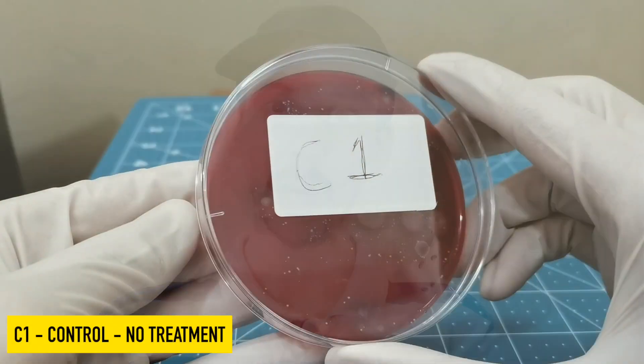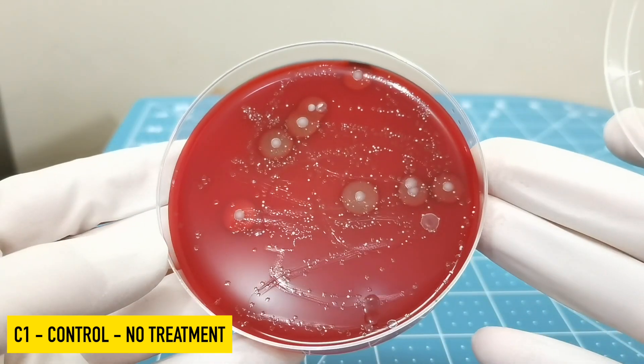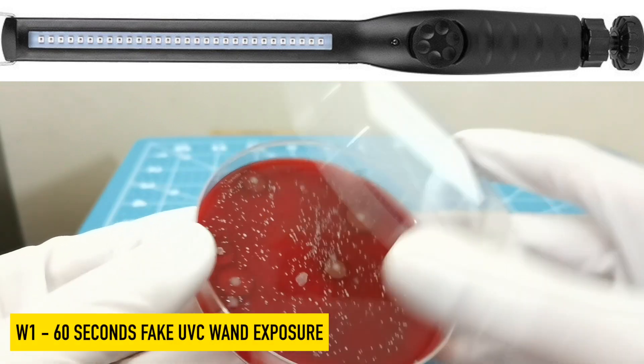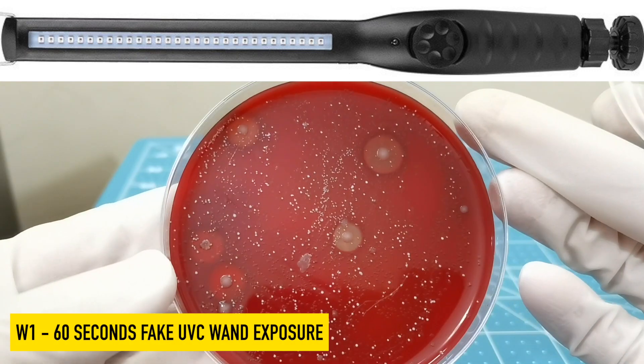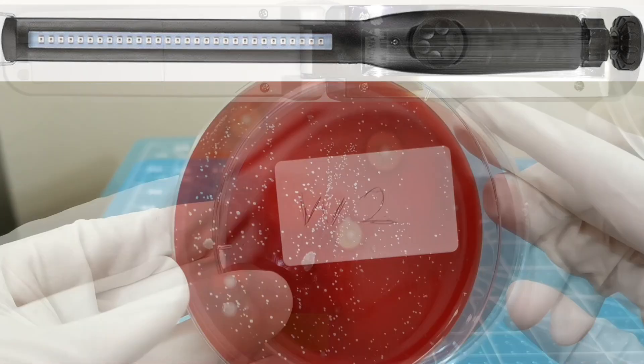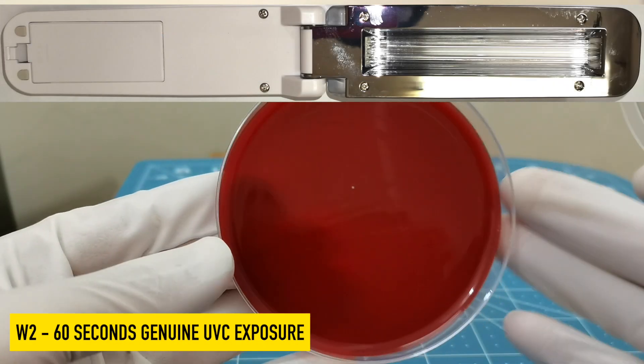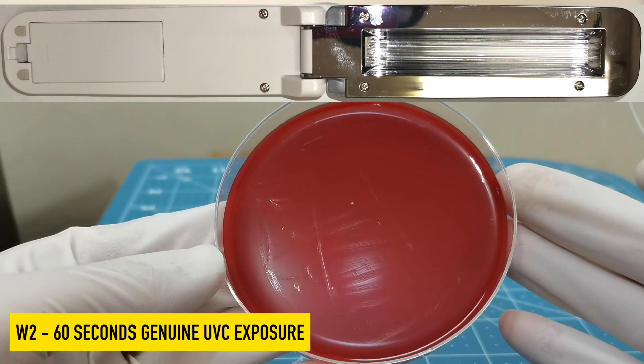Here are the results after 24 hours. The control obviously has a lot of growth. The one that was treated with the fake wand also has a lot of growth.